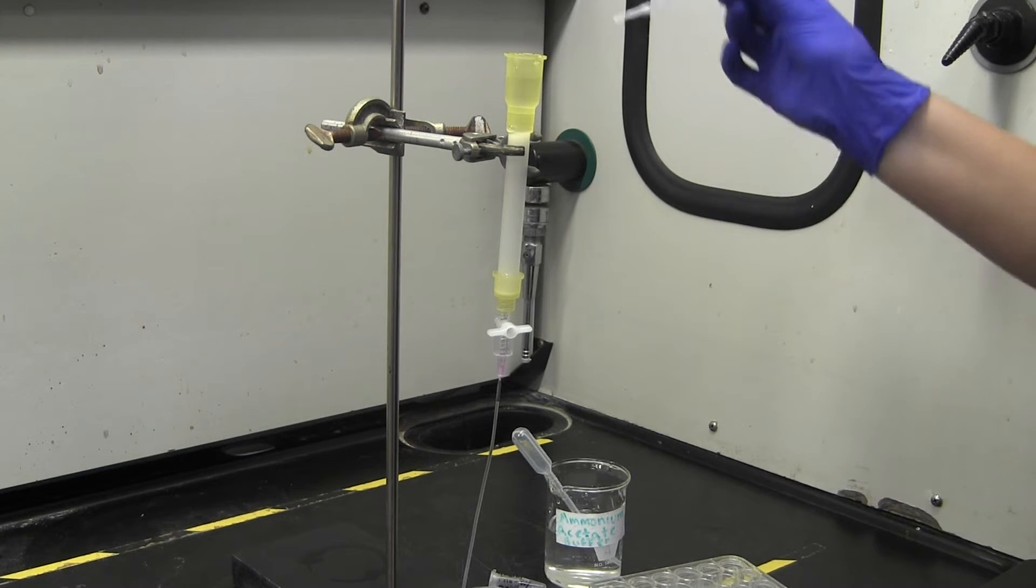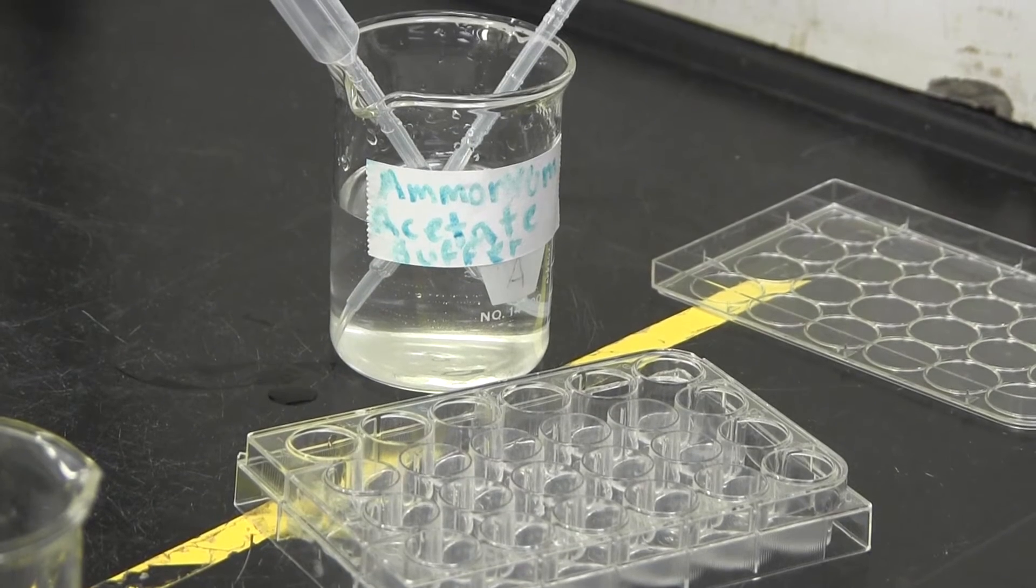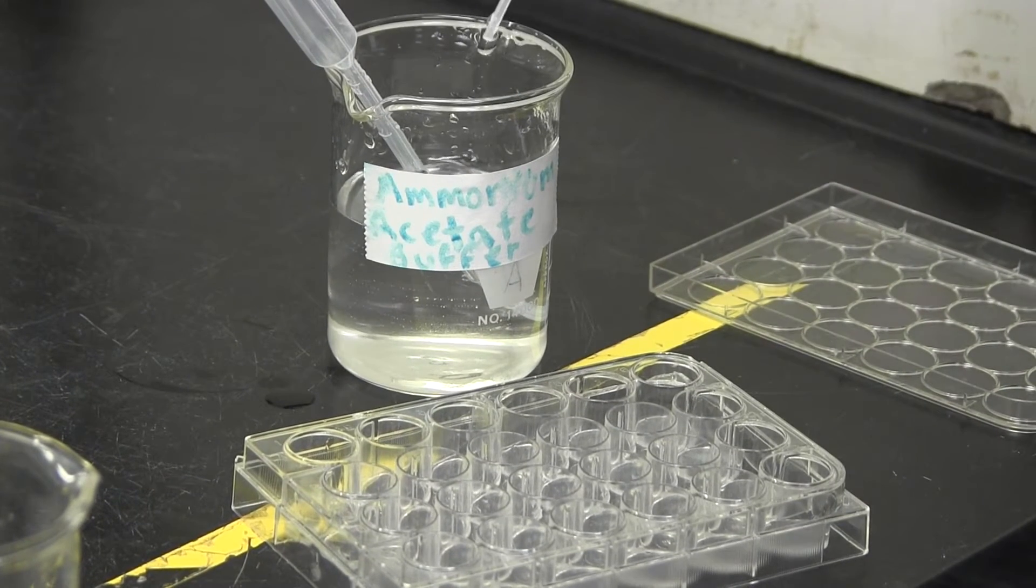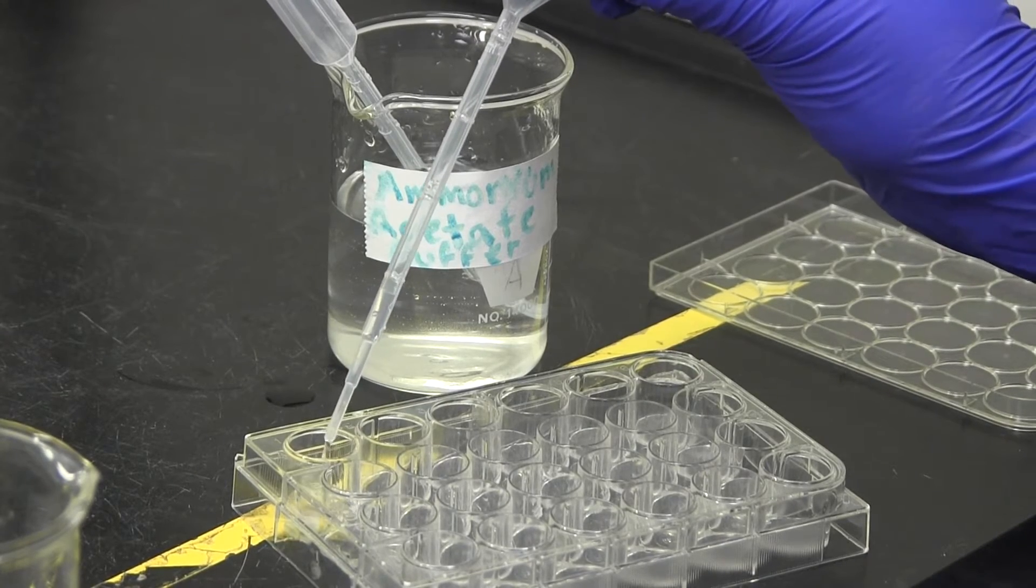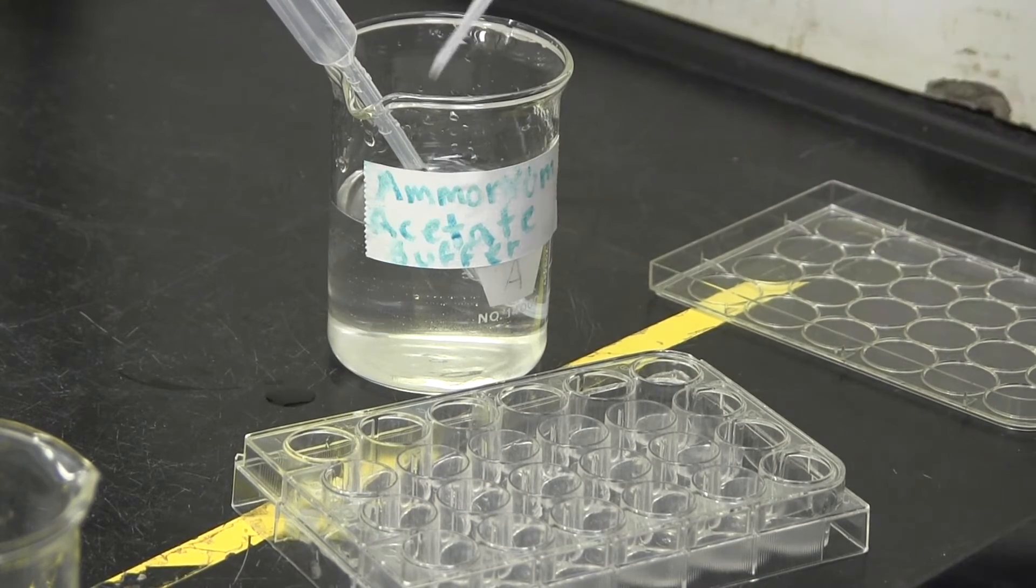While this is running, prepare your well plate. You will be collecting fractions in about 0.8 milliliter parts and it will help to put a pre-measured amount of liquid in the first well. This will help you judge the size of the fractions to collect.